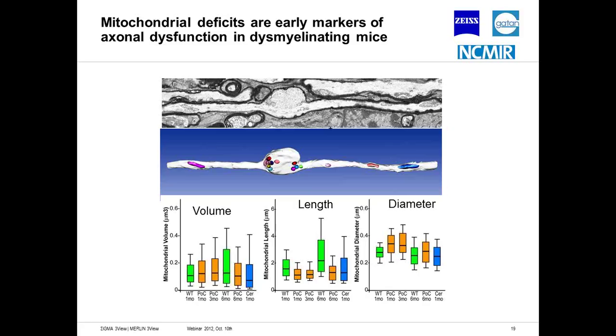The real story here is the length. When you compare the wild type to the knockout mouse, the knockout, the mitochondria never really extend into this cigar shape that the wild type or the healthy mouse has. And again, they were able to collect enough data to generate 3D models of mitochondria and to do statistics on the models. And that's something that you don't have enough resolution for in a light microscope, and you just don't have the real estate taking serial images in the TEM.